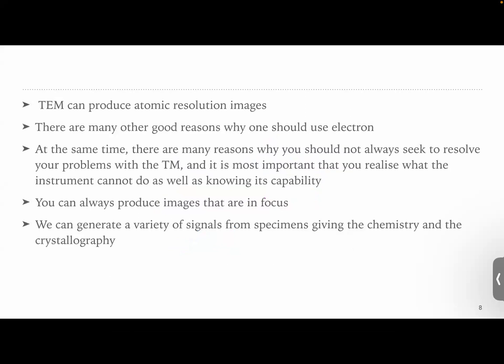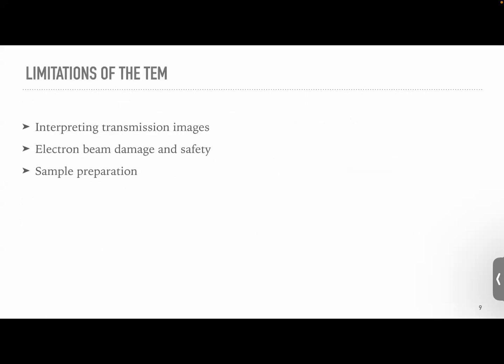Moreover, in the case of TEM, it's a destructive technique. So the sample you are making especially for the TEM, you cannot use further for any other thing. And there are some limitations for the TEM that we will talk about when we talk about the instrumentation. But it can focus very precisely, so you will get a very clear picture of your sample at atomic limits. So these are the limitations which I have talked about already.